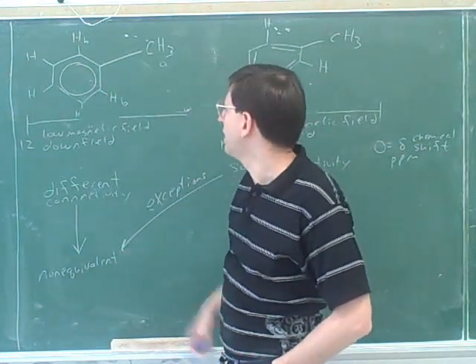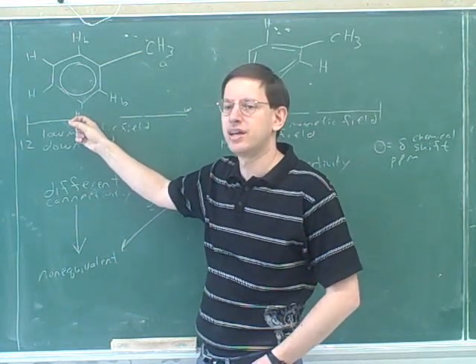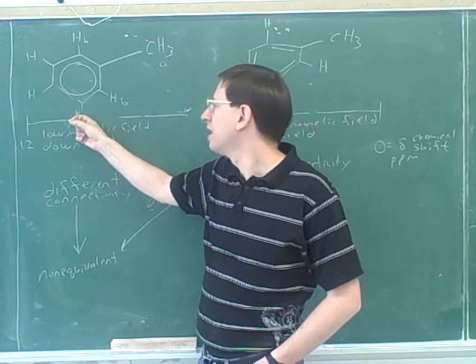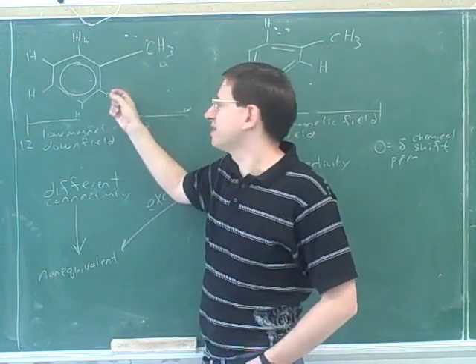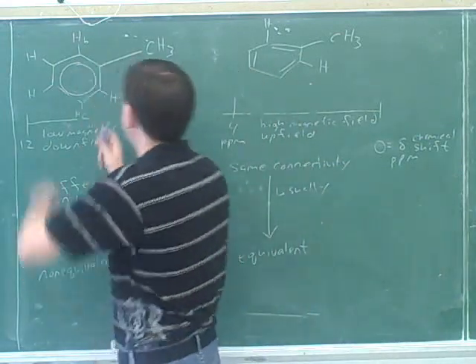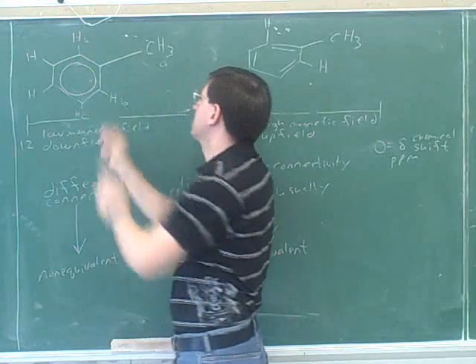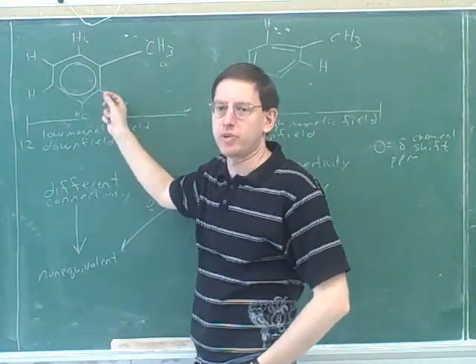Okay. Well, then how about this? Should this be called B, or does it need a new letter C? I would give that B. Now let's think about that. This hydrogen is further away from the methyl group than this hydrogen. Oh, already B. Sorry, that would be C. Yeah. Remember, these two were the ones we called B, because these were the A's over here. Well, this hydrogen is further from the methyl group than this one.